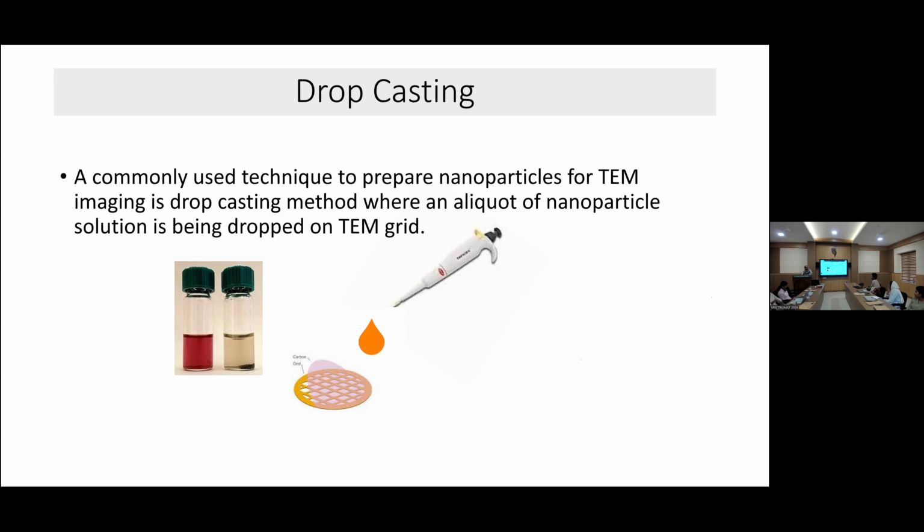What is drop casting? In polymer film preparation, we follow this drop casting method to produce polymer films. We just add some solvent dropwise and then dry it, and we get a film. Okay, that is drop casting. We follow the drop casting technique for liquid and powder samples also. First, we should prepare a low concentration solution in a suitable solvent.